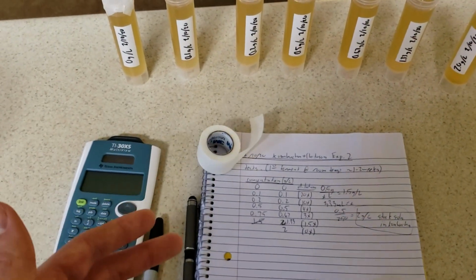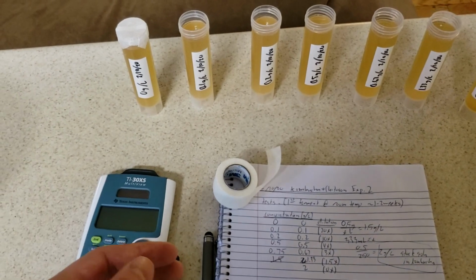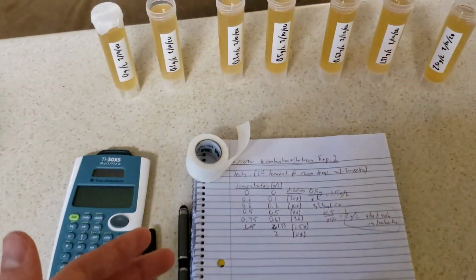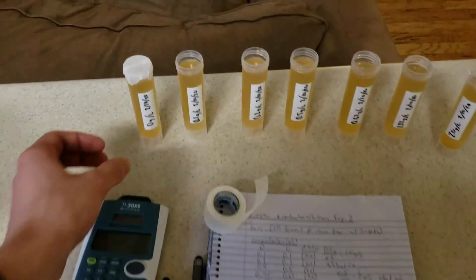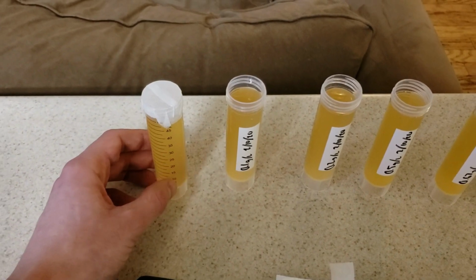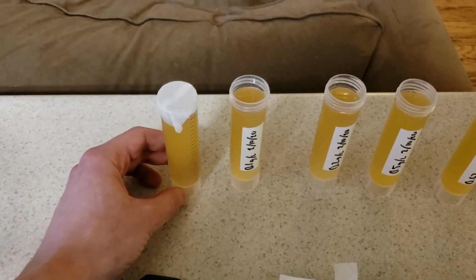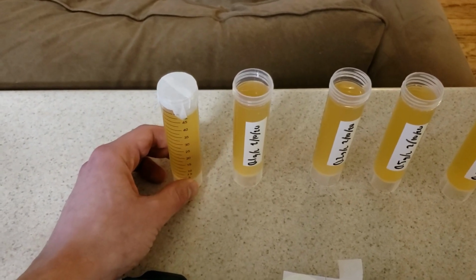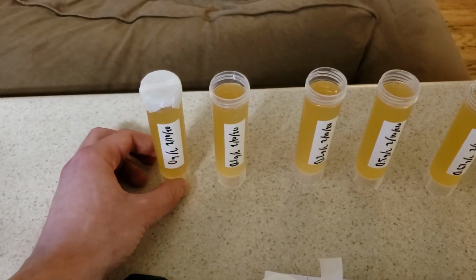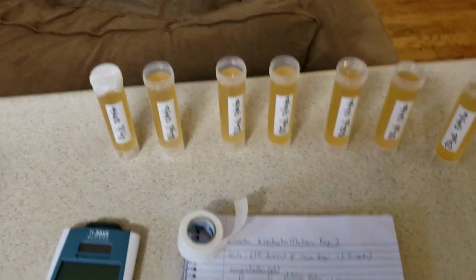When you're actually doing the experiment, make sure you do proper dilutions. If you're working with concentrations, make sure you're using equipment that is accurate. For example, these test tubes, even though they have graduation lines, that doesn't necessarily mean that they are meant to be used for measuring. These are just an approximation. So make sure you're using things like pipettes and graduated cylinders and accurate scales to measure whatever you're working with.